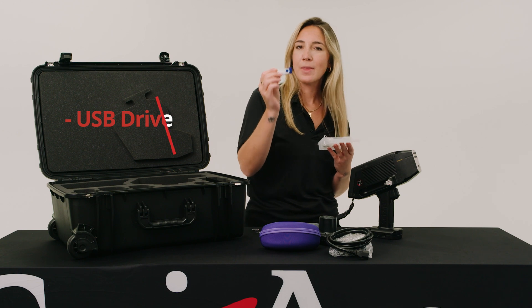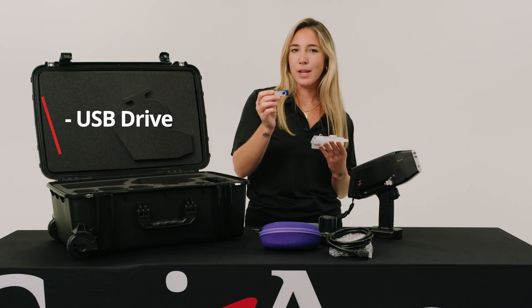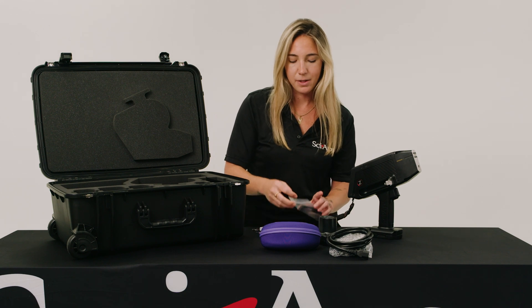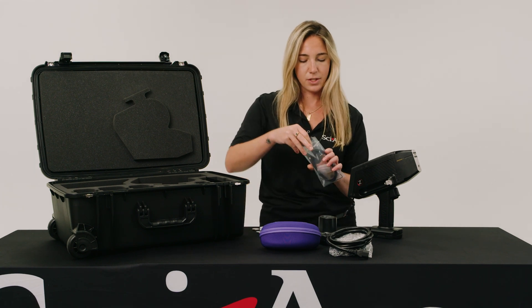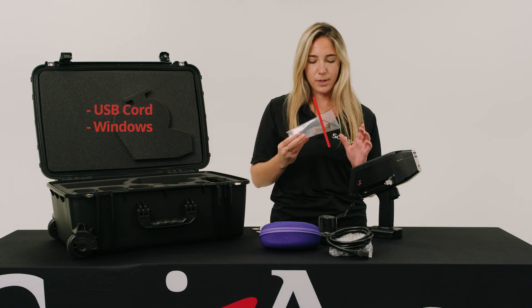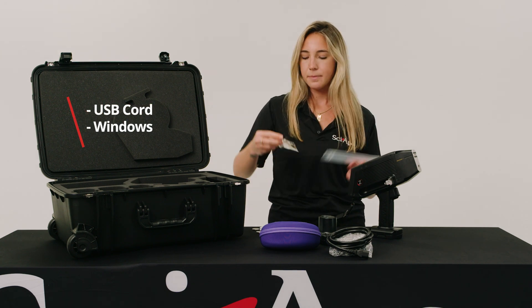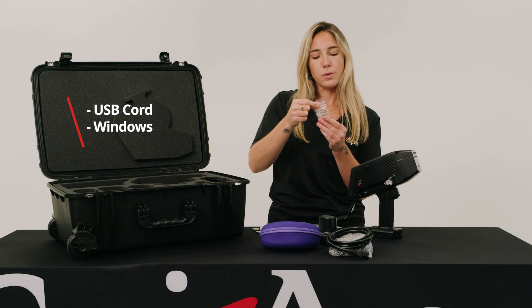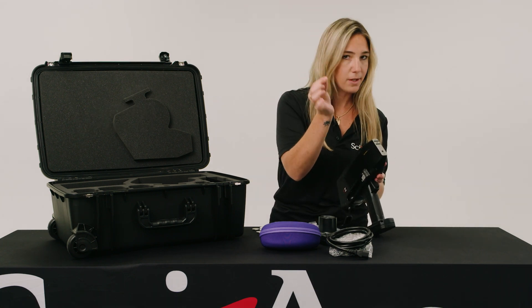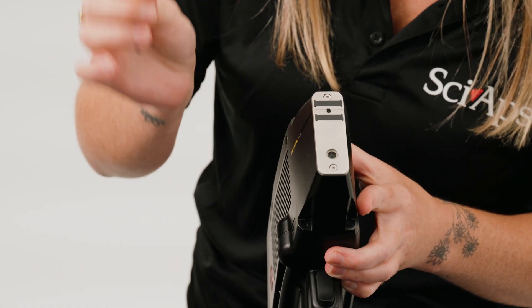We also have a USB stick that has your manual and a download for Profile Builder. If you would like to connect to Profile Builder on your laptop or desktop, you would be using this USB cord. Also included are some quartz windows or splatter shields and some O-rings.